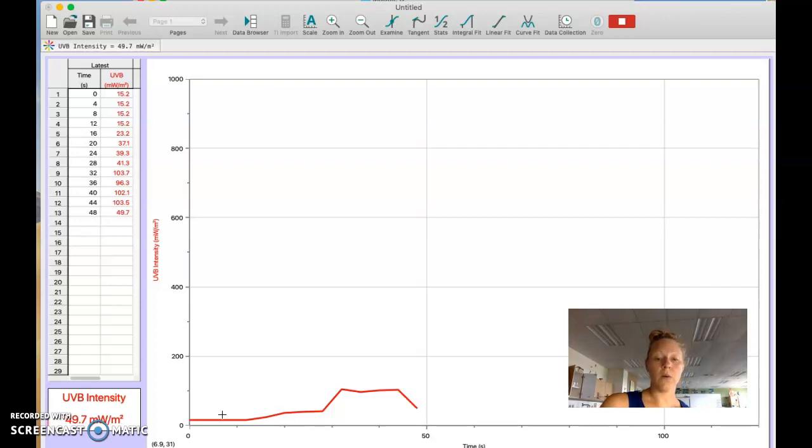And now I'm going to take it away. So what I'm going to do is stop data, and I want to show you guys how to analyze this data.